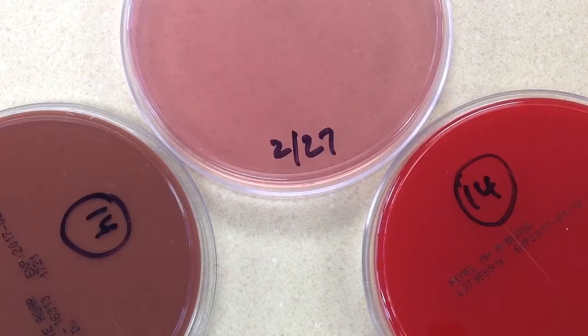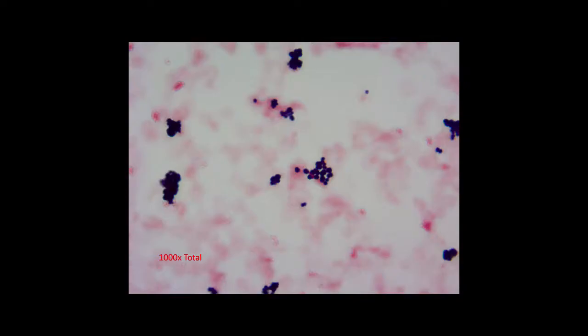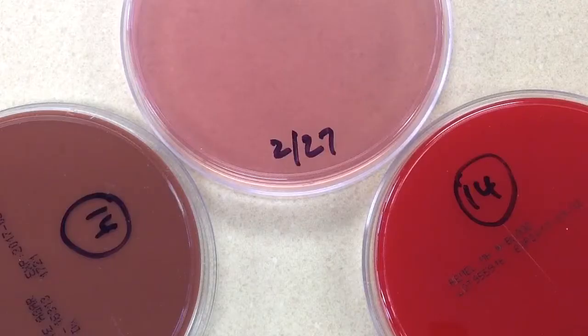When the gram stain was done, gram-positive cocci in clusters were seen. With all positive blood cultures, the physician needs to be called. So yesterday, when the instrument beeped and the gram stain was made, the doctor was called. At that time, these plates were set up and incubated overnight, and we're reading them today.